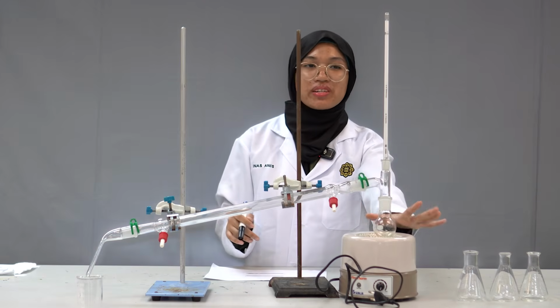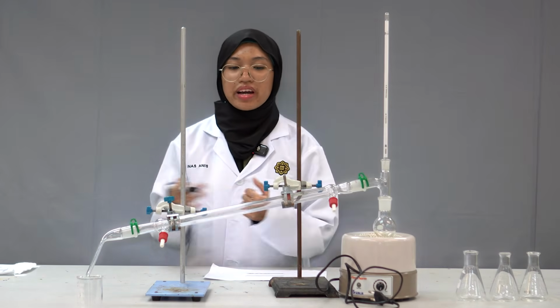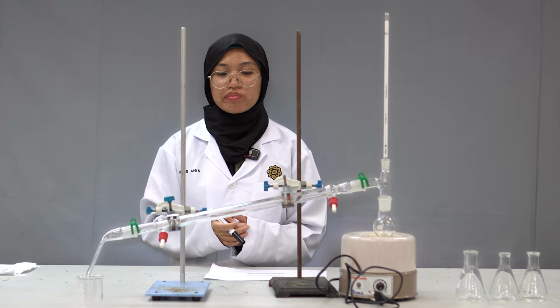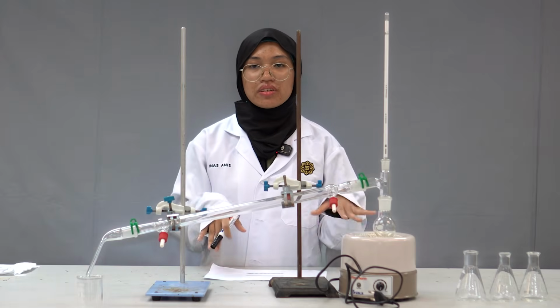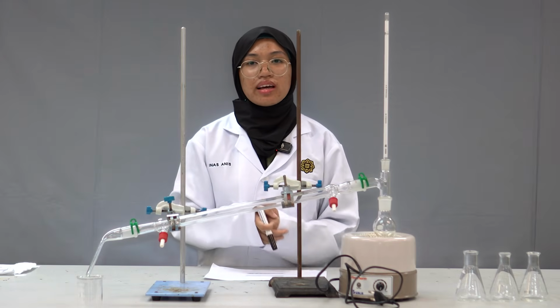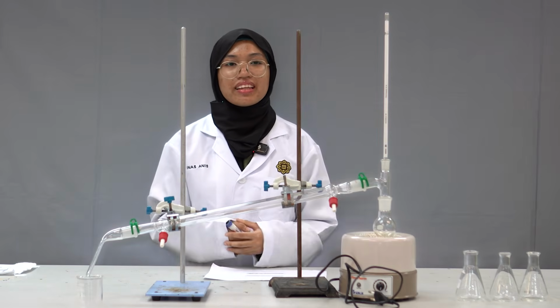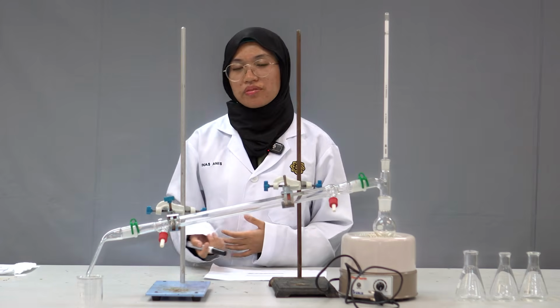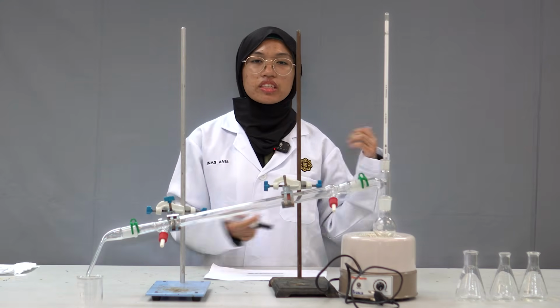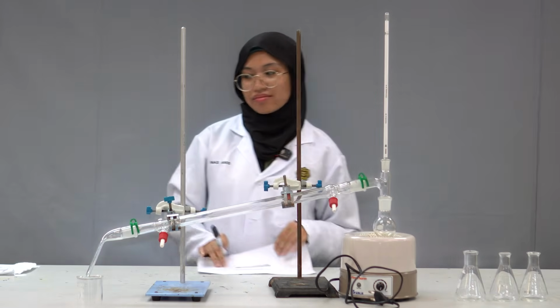And over here, we will have our base. Yes, that's the principle behind it. Something to note is we need to make sure that everything is secure so that we can conduct this experiment smoothly. And I think that's it for my part. I will pass the floor to Alia, who will explain the real-life applications of distillation.